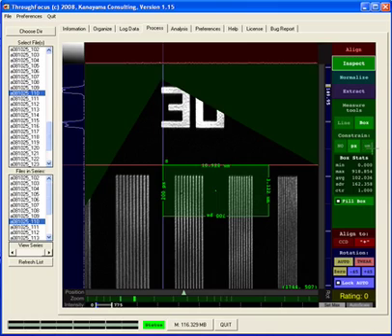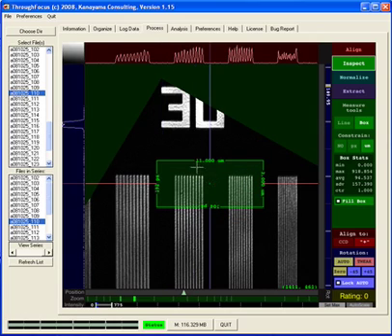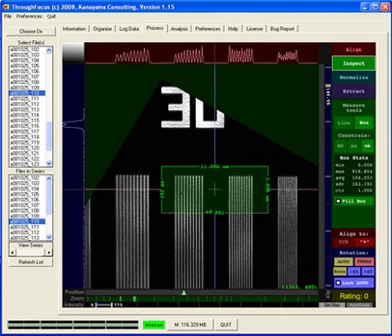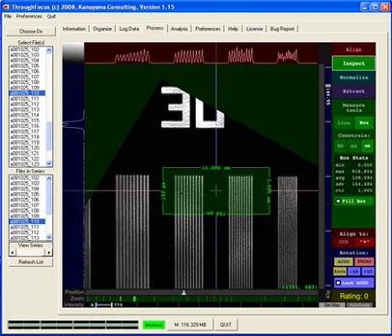And I have the same option here with microns. It says micron. Now the boxes are going to be stepping in sizes of 0.1 micron. Now these numbers on the edges, there's a little bug in the program. They don't update perfectly, but you can still draw it in the 0.1 micron steps. So now, as you can see, when I click with the left mouse button, I can reposition this exactly the way I want it.